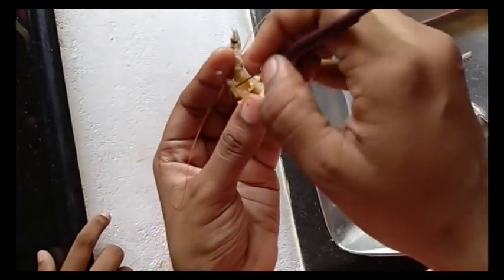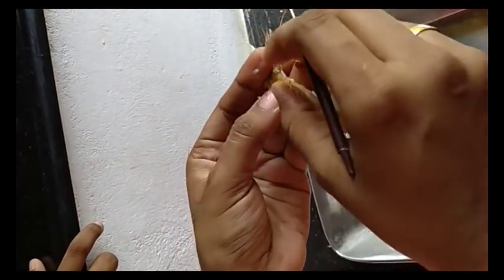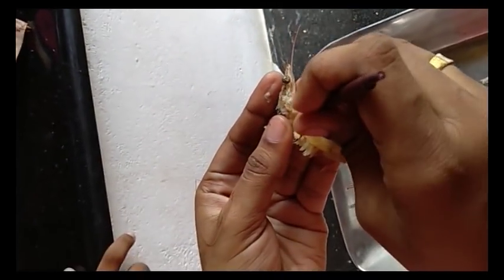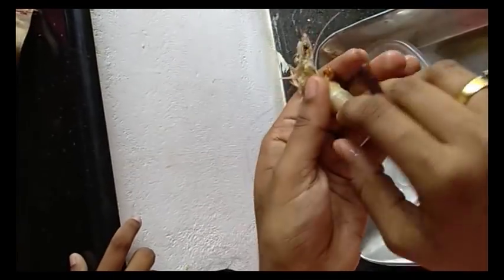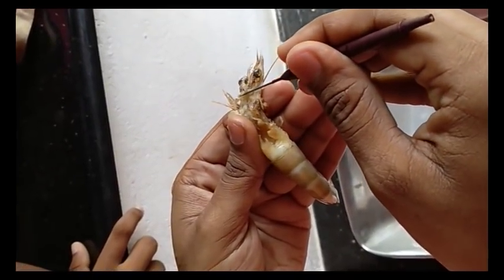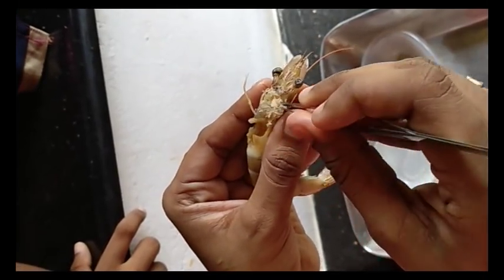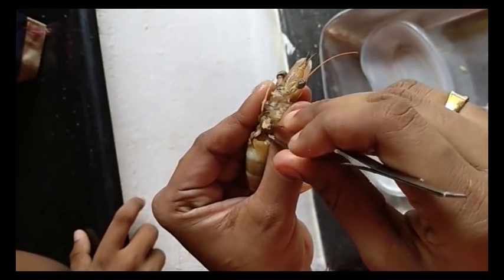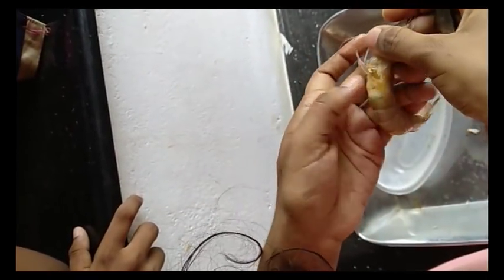Going to trace downwards. To trace downwards, you have to remove this. Here you can see the stomach and hepatopancreas. We have to remove that and trace downwards. Remove the flesh. You can see the nerve here. See the nerve in cream color, off-white color nerve.